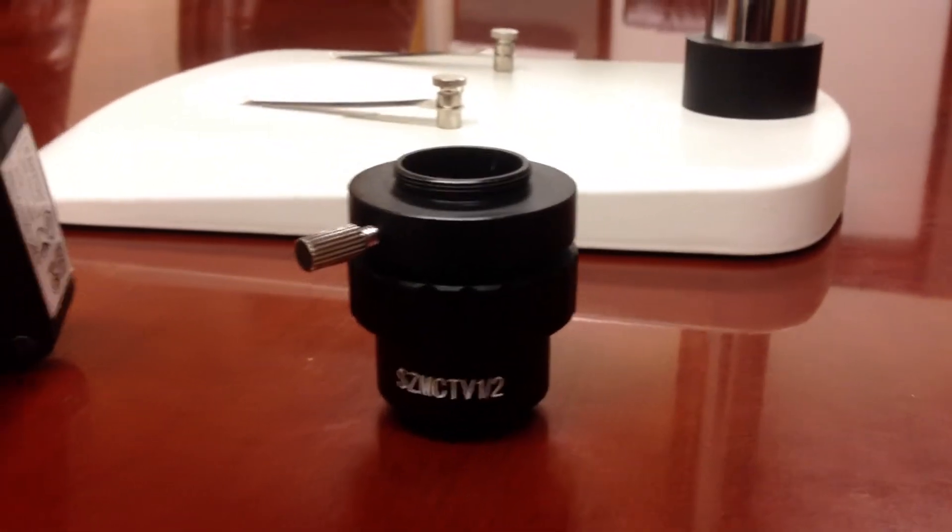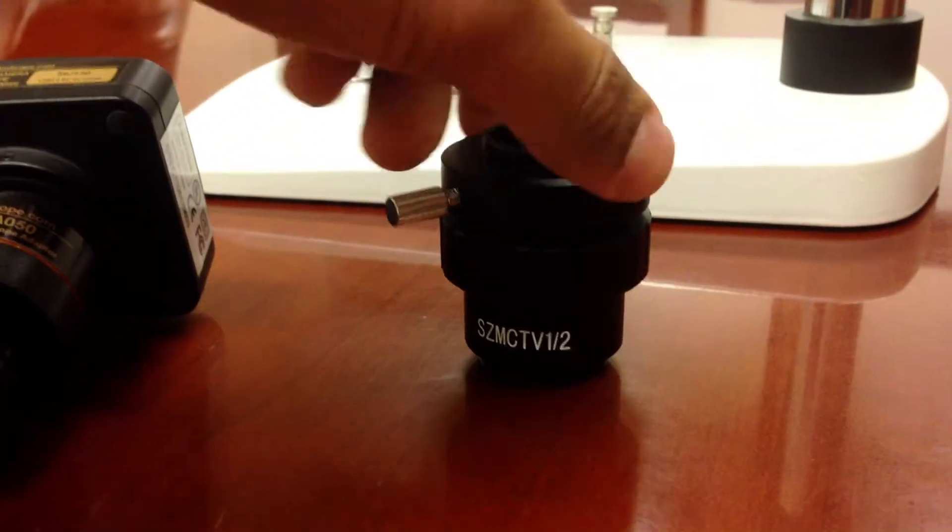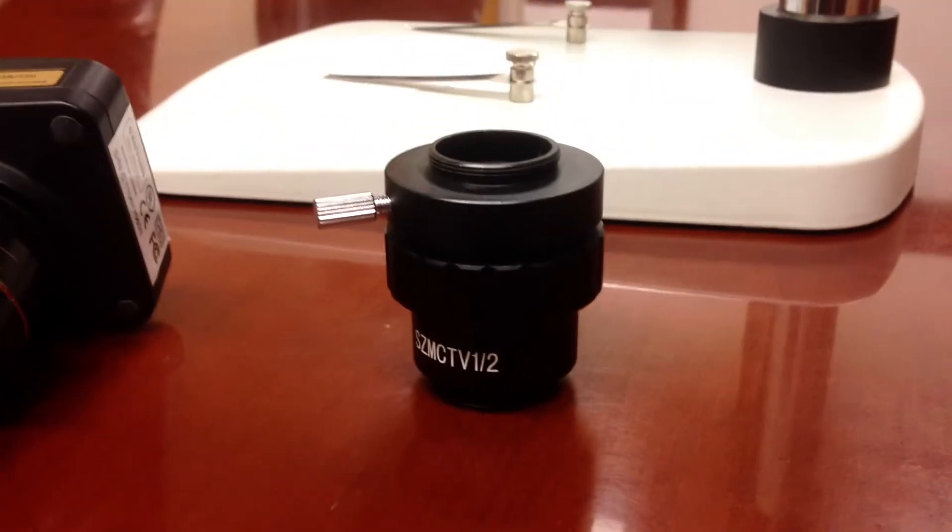Now we also sell a part that we call the AD-C20, which is also a reduction lens, but it's of a different type. And sometimes it gives you a better field of view when using our MU series camera.